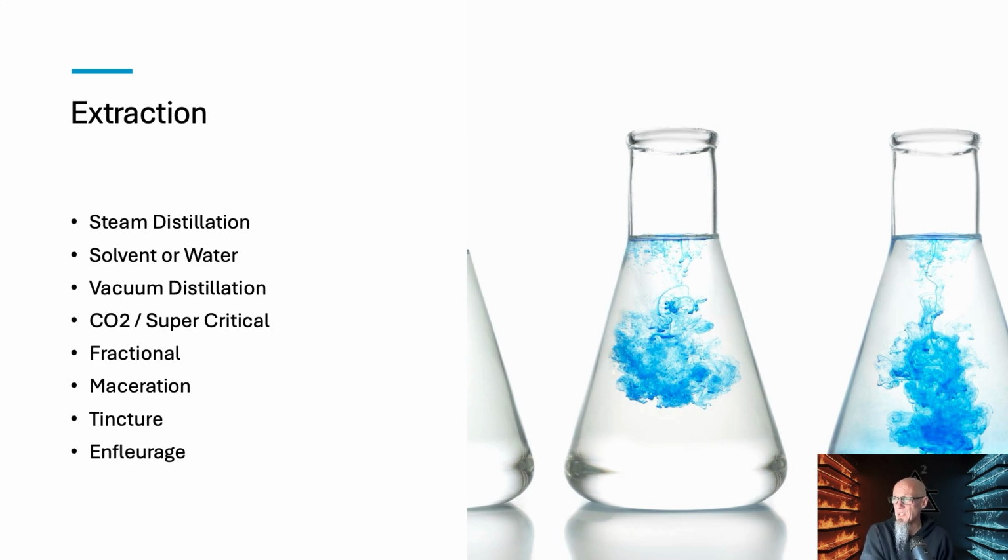Okay, so steam distillation, the extraction is performed through steam passing through the plant material, vaporizing volatile compounds. The vapor condenses into essential oils and hydrosol. This is actually the most common method for essential oil extractions across the board, I think, now that I'm thinking about it. It's ideal for hardier aromatics such as lavender and peppermint.